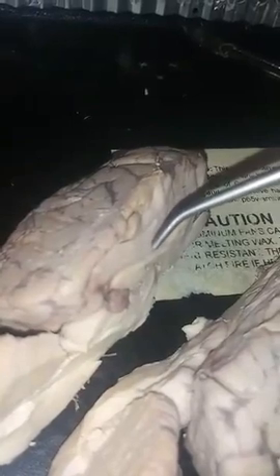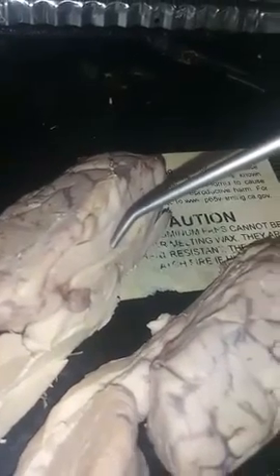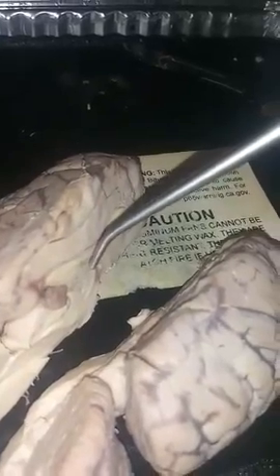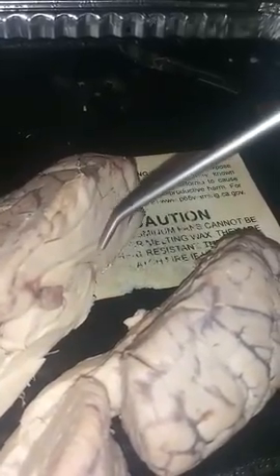Right here is where the white matter is located, which is the bundles of myelinated axons within the brain and the spinal cord. It is found in the inner portions of the cerebrum and the outer regions of the spinal cord. Right here is the gray matter, which is areas of the brain and spinal cord containing cell bodies, dendrites, and unmyelinated axons. It is found in the cerebral cortex of the brain and inner portion of the spinal cord.